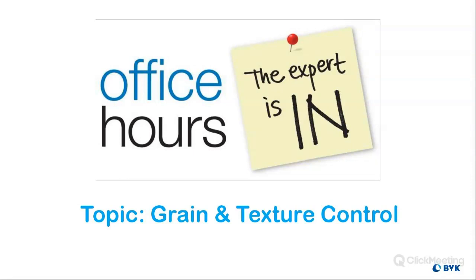Next question. Ronald, do clear coatings interfere with measuring textures? I imagine clear coatings wouldn't be too much. Well, it might have a similar effect as the glass question, especially if it's smoothing the surface. So again, I hate to sound like a broken record, but send us some samples. We'd love to take some measurements and find out firsthand. See how well it goes.